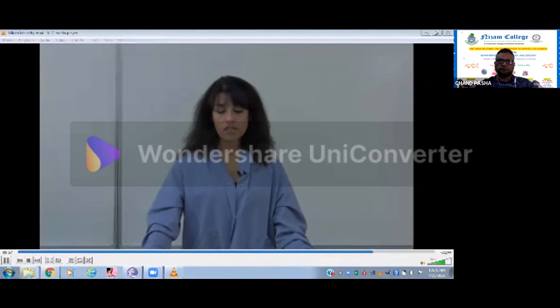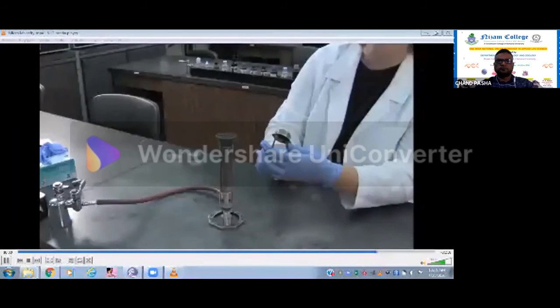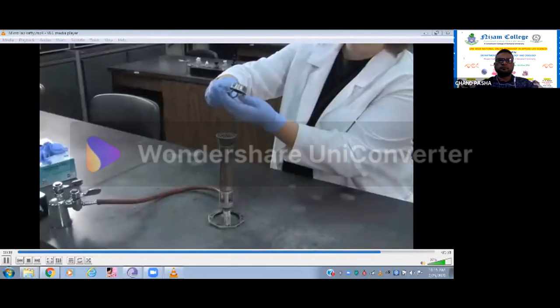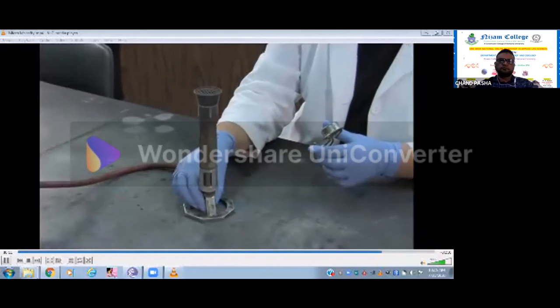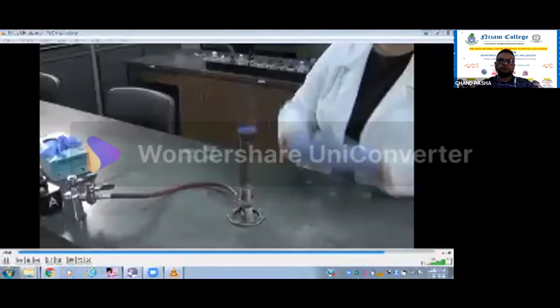Learn how to light your Bunsen burner correctly with the striker. If you have trouble, you've tried more than 2 times and the Bunsen burner won't light, turn off the gas, check the striker to make sure it is making a spark, check to be sure the valve at the base of the burner is open, and try again.